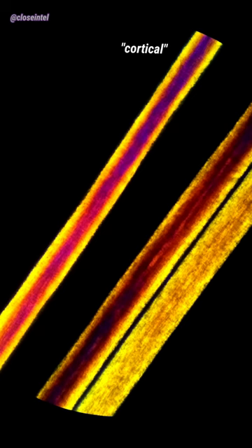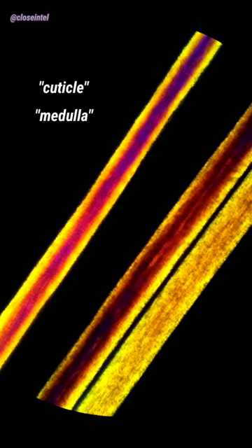The birefringent properties of hair is mainly from the geometry of the cortical region, which is the middle layer of hair between the cuticle and the medulla.